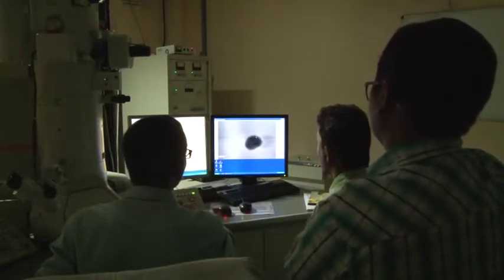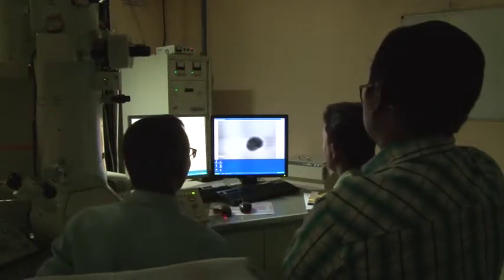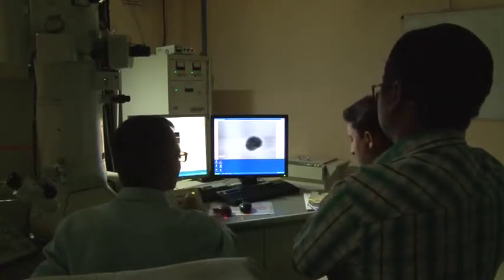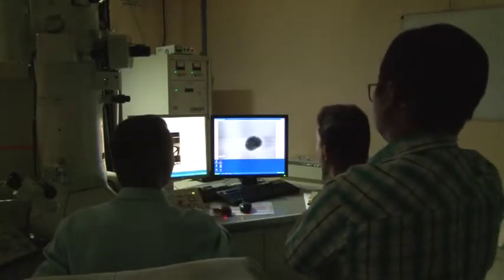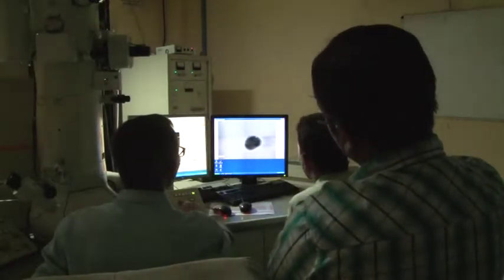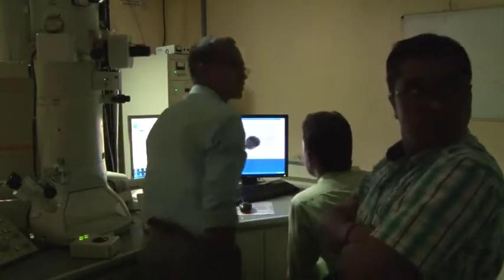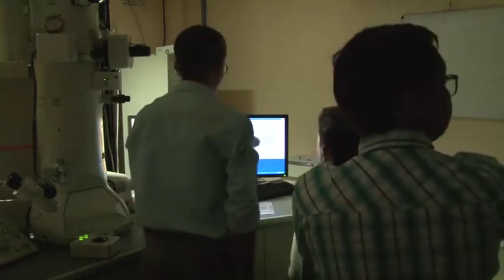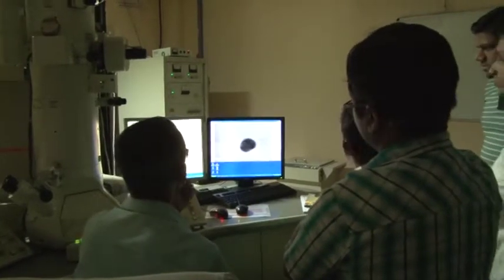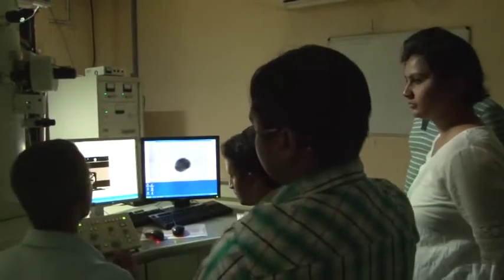Indeed it is appearing. There is one grid because somebody opened the door also. Now you see there is a black fringe. When it is over focus, that means more current. Over focus is not that good. So you come back, and the objective focus is good when there is a slight white fringe, which looks much better. So we have learned these 4-5 steps. What remains is, yeah, I think this is a good time to begin.